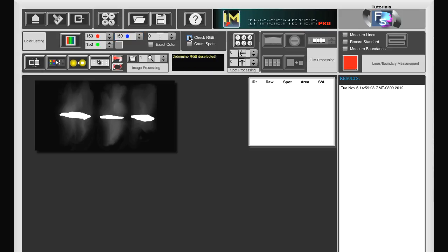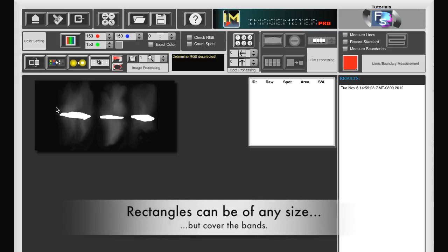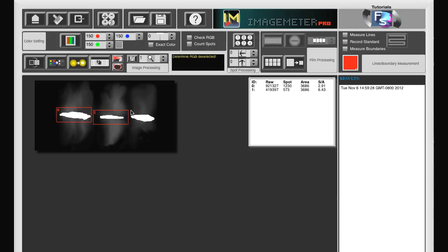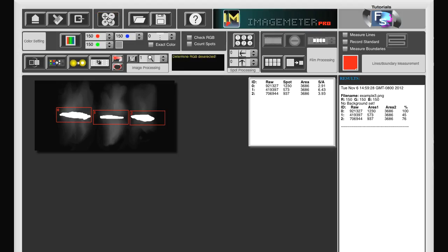We then uncheck checkRGB and we create rectangles again. Let's create again same size rectangles. We then press the calculate button again.